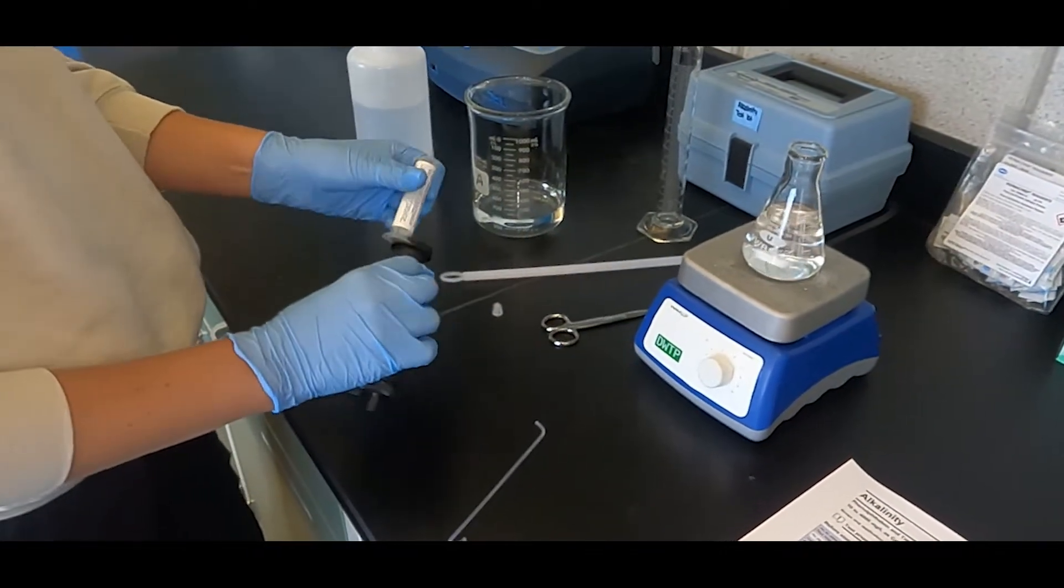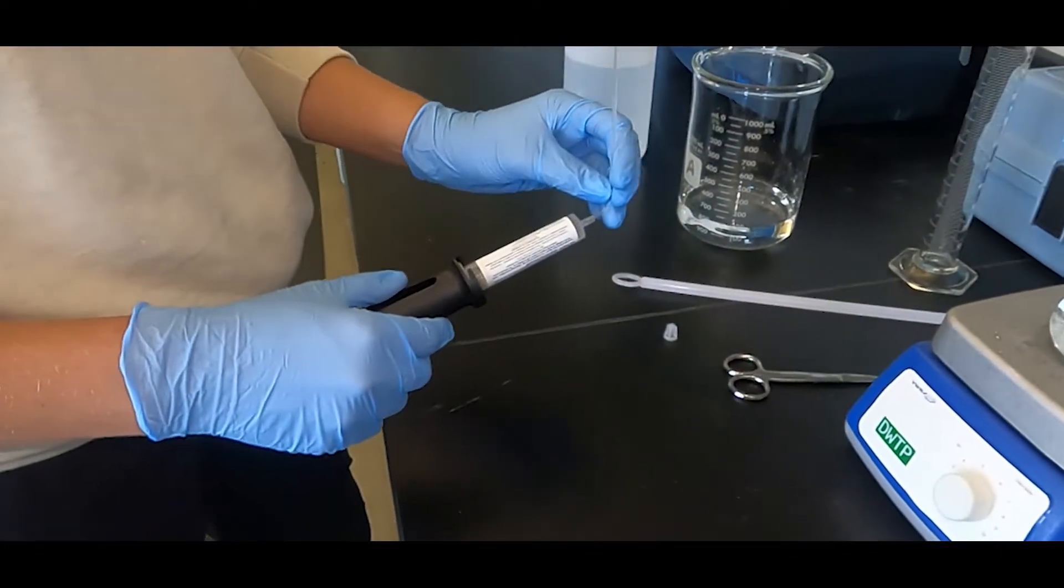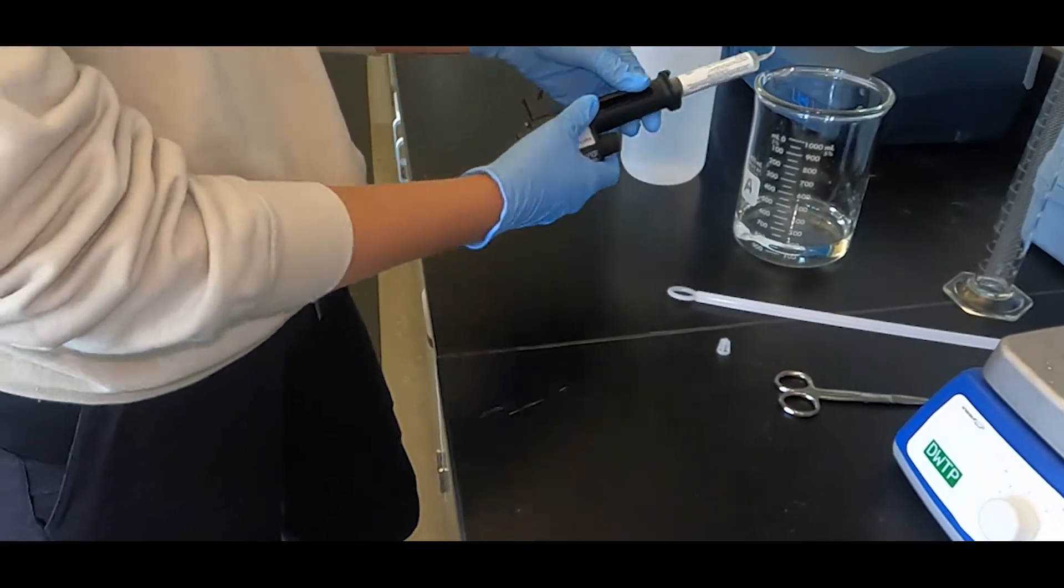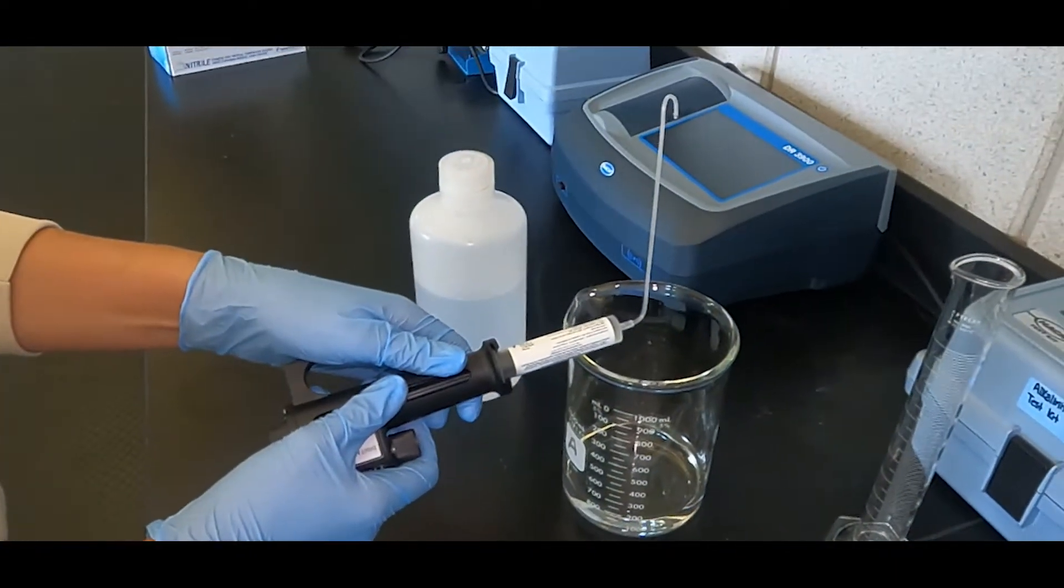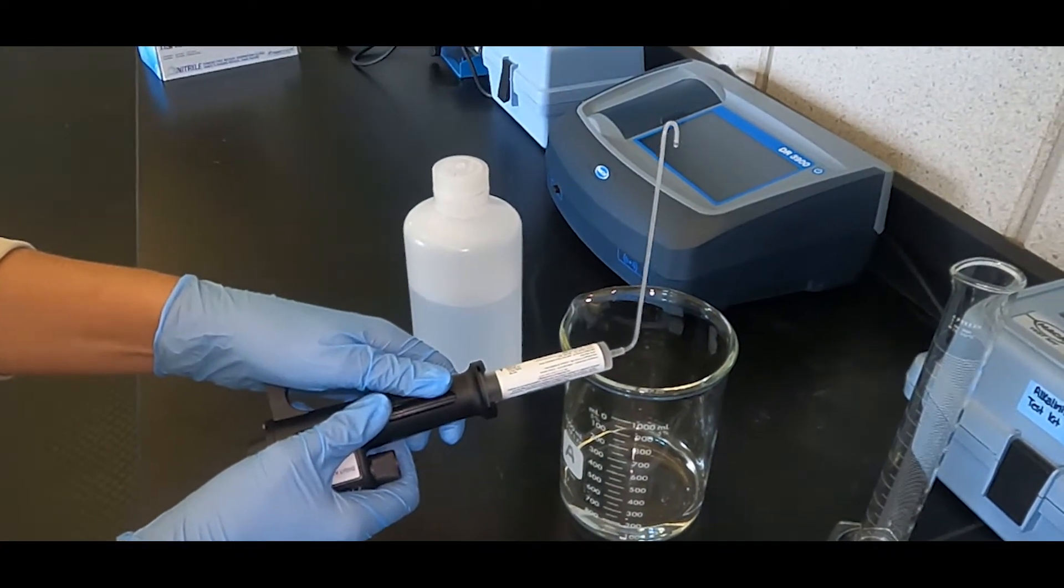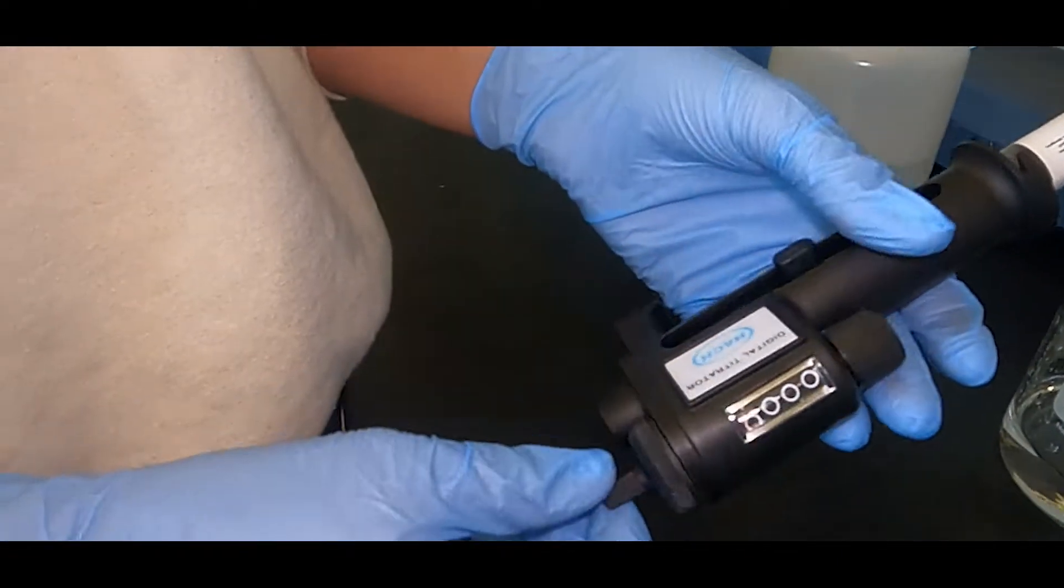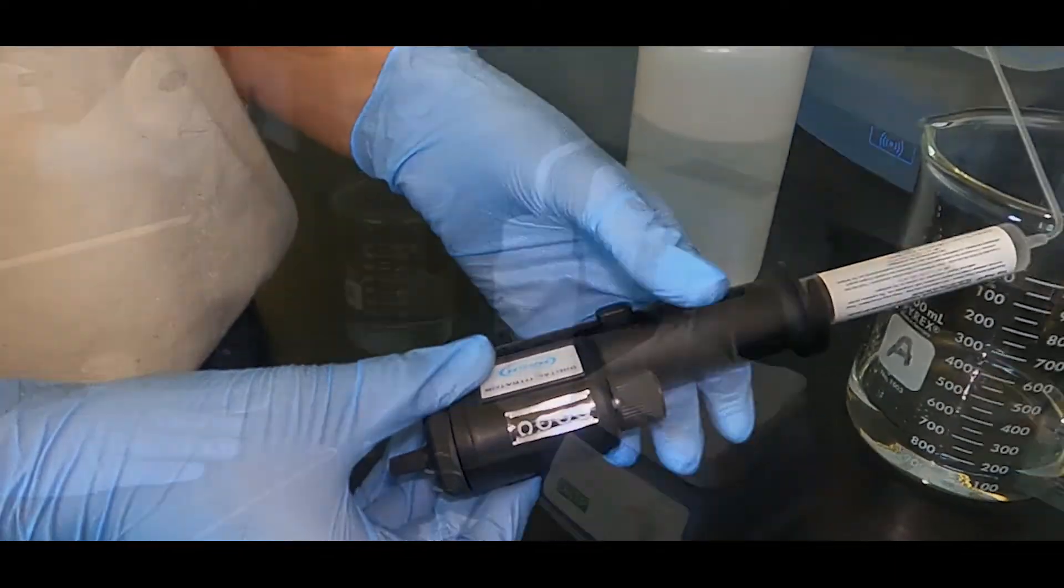Assemble the digital titrator following the instructions provided. To prime the delivery tube, hold the titrator tip up and eject the air and a few drops of the titrant into a waste beaker. Reset the counter to zero and clean the tip.